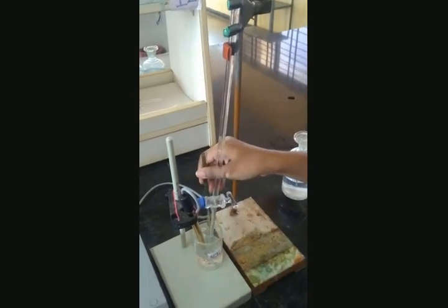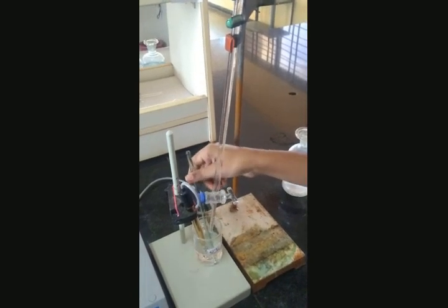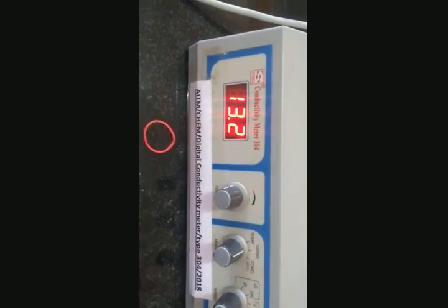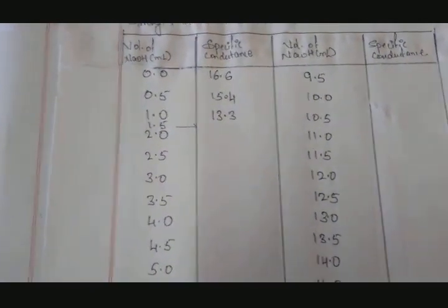Shake the contents thoroughly and note down the conductivity value, that is 13.3 after 1 cc of addition. So 12.4 is the value which is recorded for 1.5 cc.